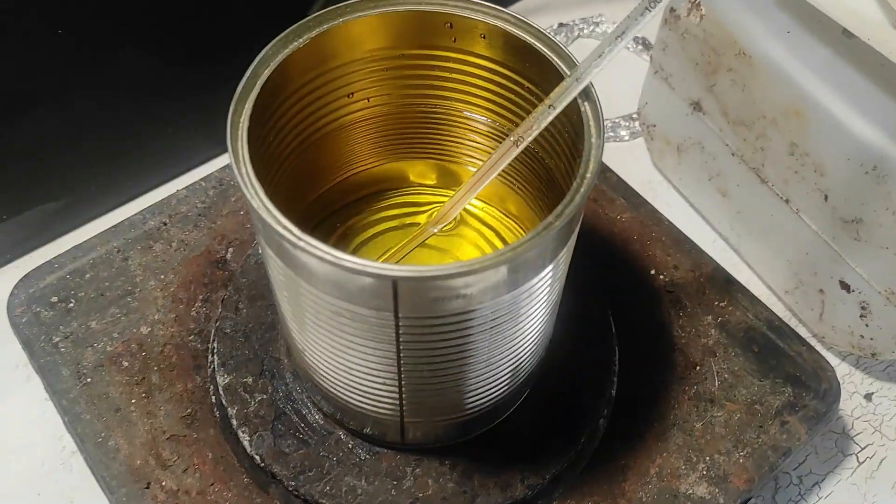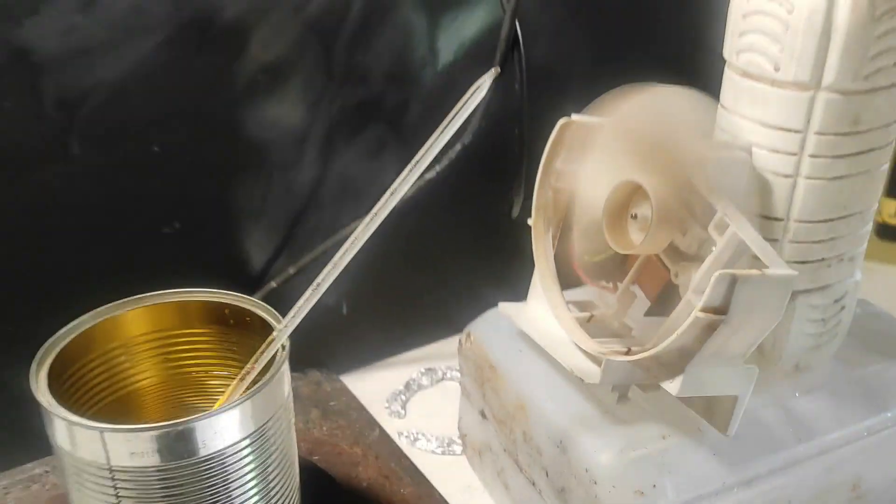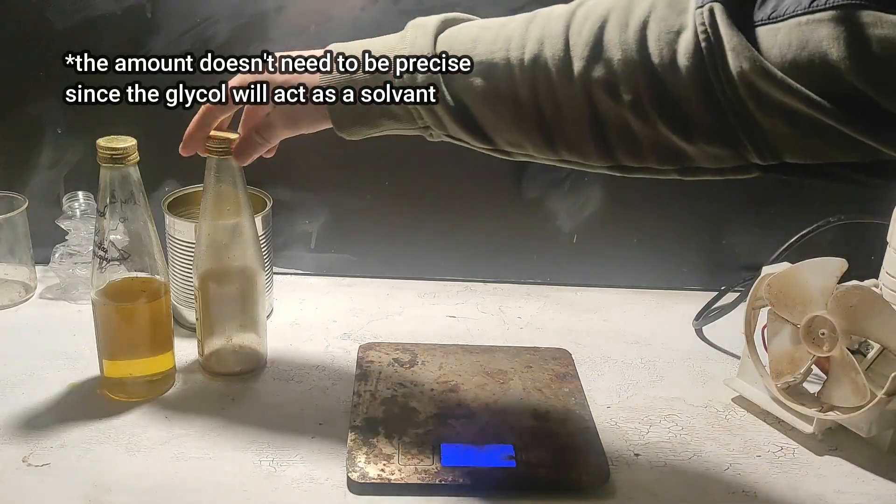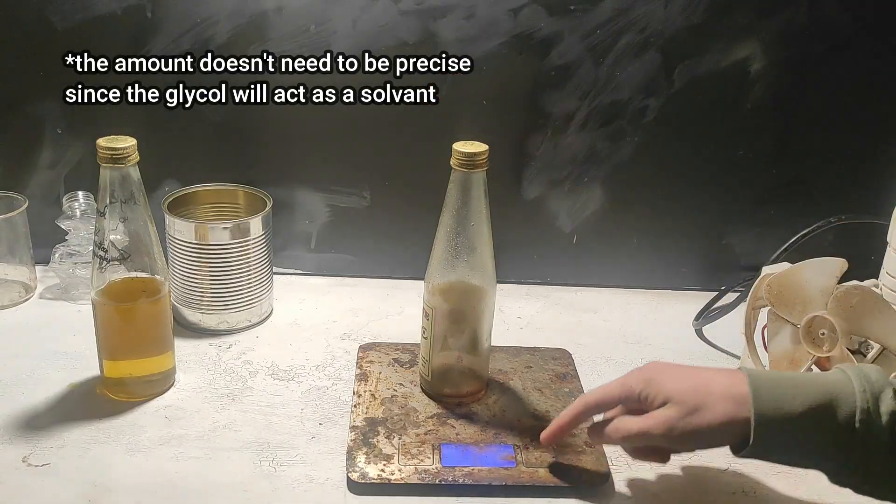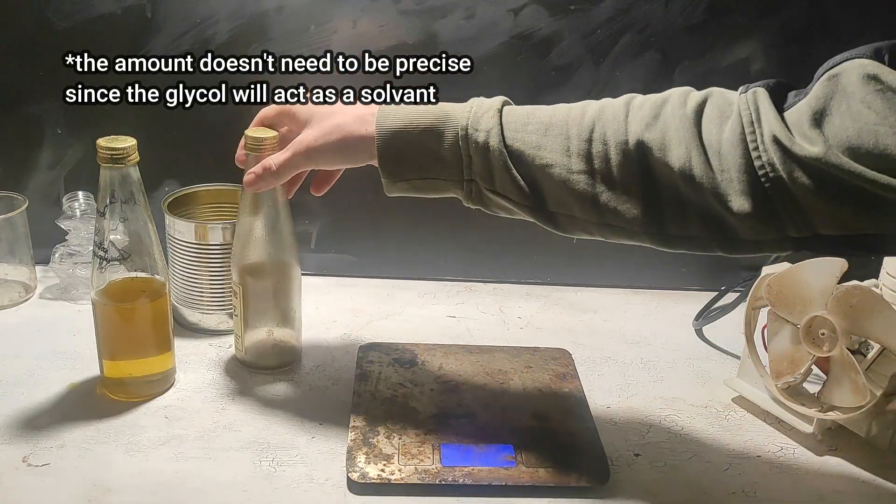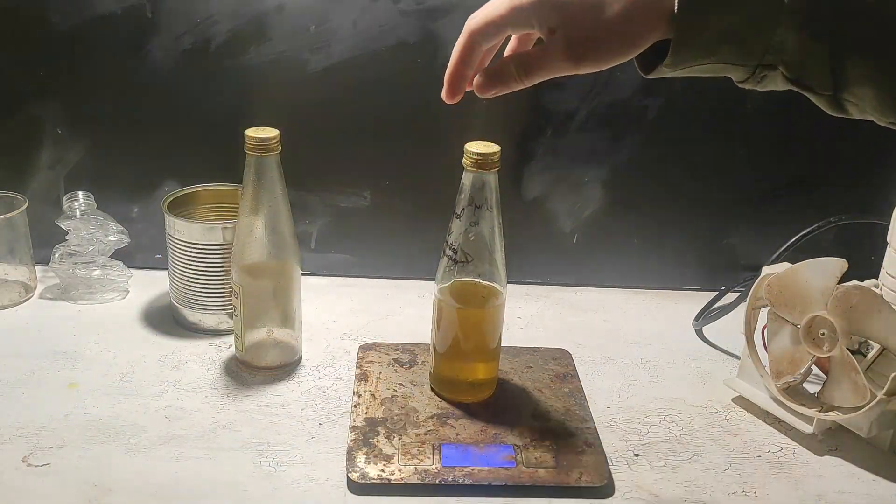I also did a second batch in this can to make sure I will have enough ethylene glycol. And to measure how much I made, I first weighed the empty bottle, and then the full one. And it seems like we have 221 grams, that's a pretty good amount.